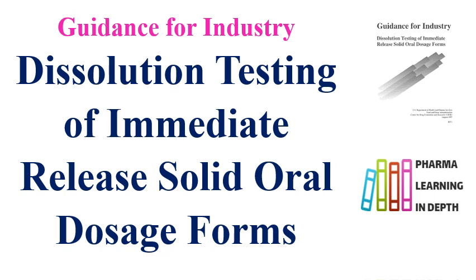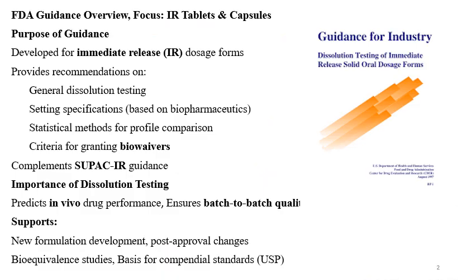So the US FDA has provided the guidance for the IR formulations. The purpose of this guidance is for the dissolution testing of immediate release type of dosage forms.